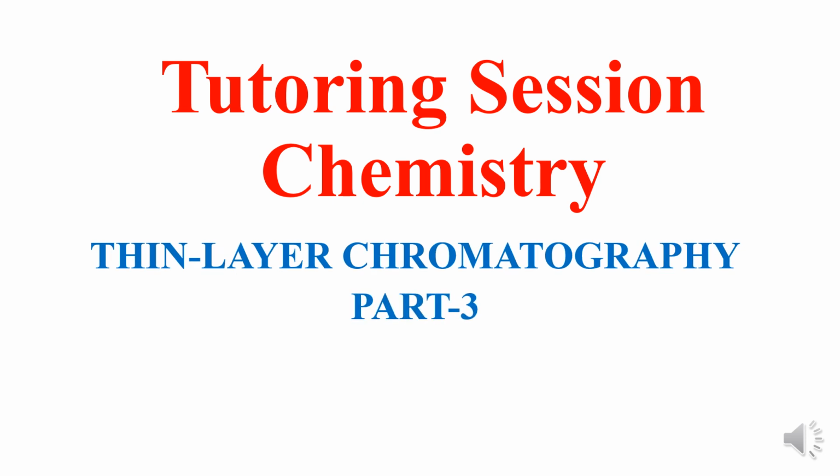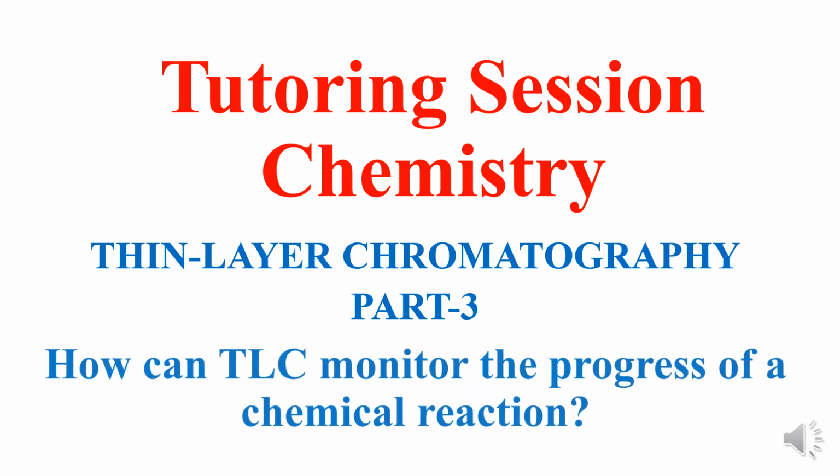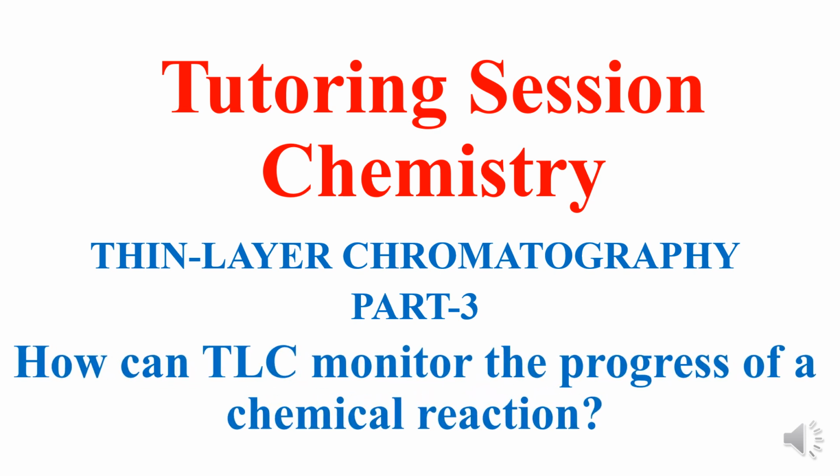The current video is part 3 of the 4-part series on thin layer chromatography. In this video, I'll explain how to monitor the progress of a chemical reaction by employing the TLC technique. Let me consider the synthesis of aspirin from salicylic acid as a representative example to explain how to monitor the progress of a chemical reaction.